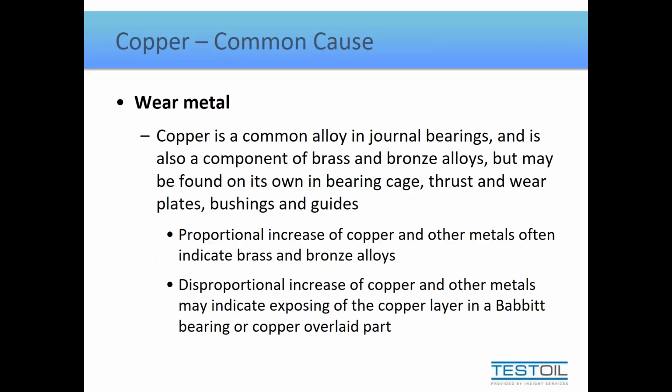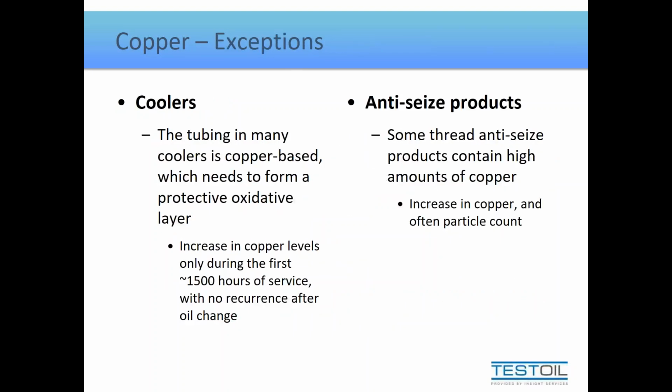Now there will be times when copper increases on its own. It will not be in conjunction with other metals, and it doesn't seem to align with your thoughts that it is a wear particle. In cases like this, a couple of the choices that we have is anytime we install, as an example, a new cooler using copper tubing, brand new copper, when it's shiny, does need to oxidize and form that dull protective oxidative layer.